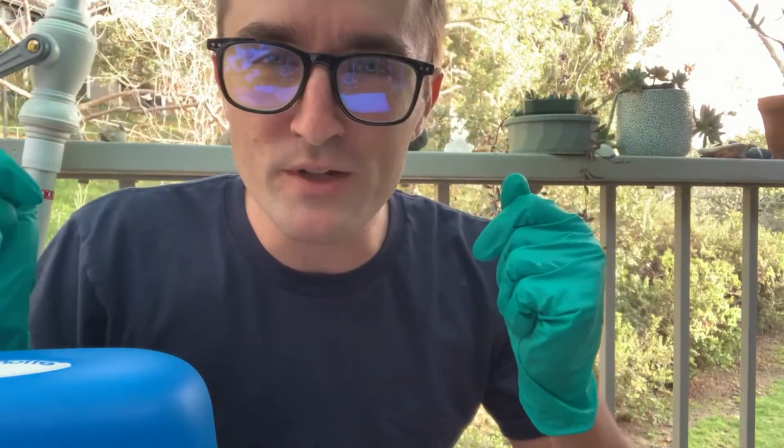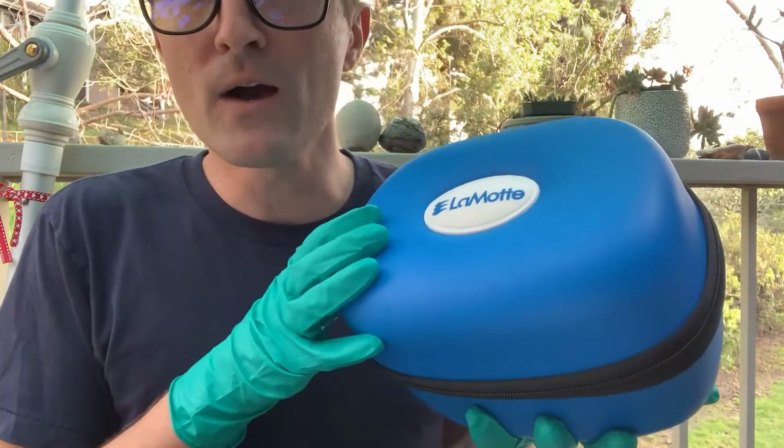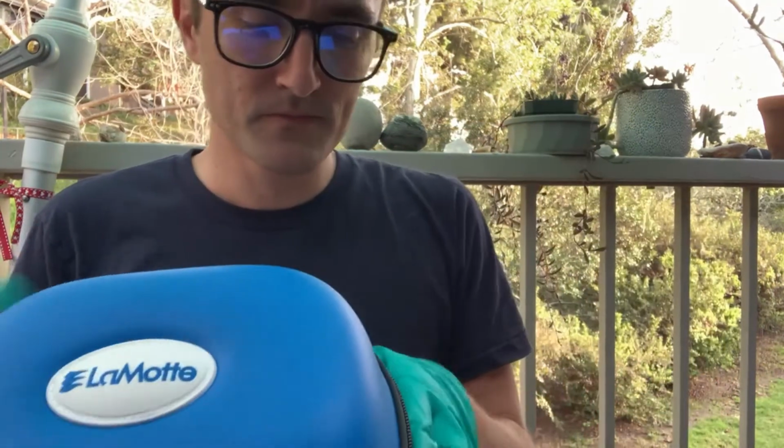But you do need to wear your gloves and you need to wear eye protection. Now I gave you a pair of gloves and I gave you a pair of very nice splash goggles. Please wear both of those while we get into this kit.